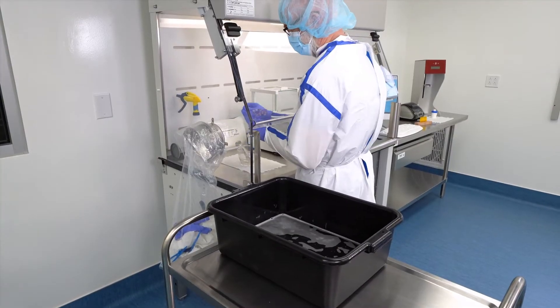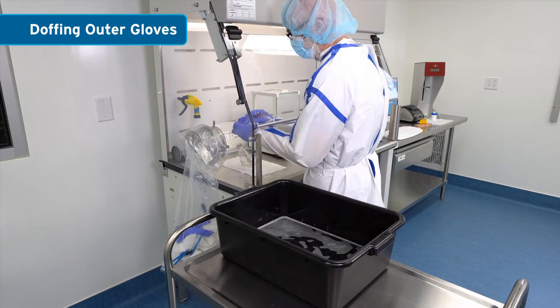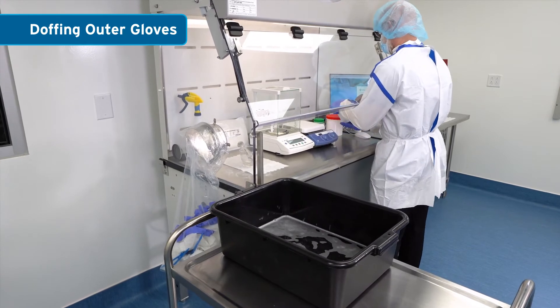The technician's outer layer of gloves was used during manipulation of powders. Prior to removing the chemical containers and glassware from the CVE, the technician should doff their outer layer of gloves and place them in the CVE's waste chute.